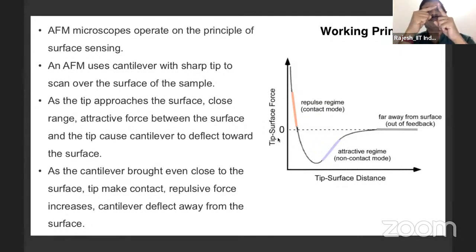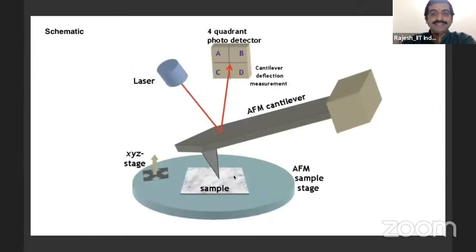In other words, if we measure the force, we can know how far the two surfaces are. And by moving this tip, we can make an image of how rough it is. So there is this very sharp tip, atomically sharp. And then you have this surface.